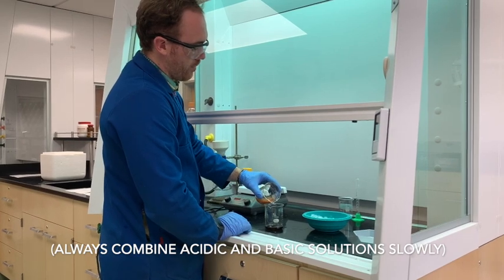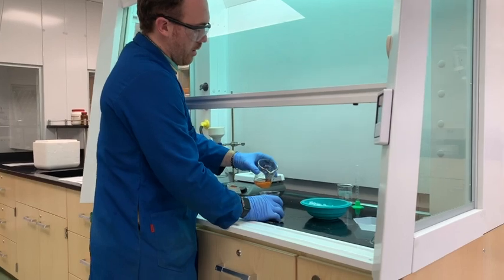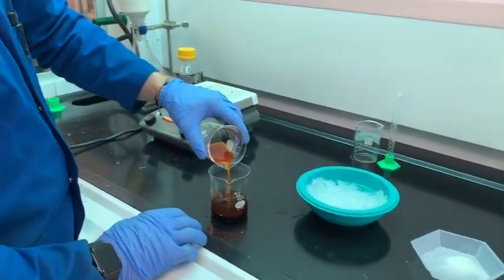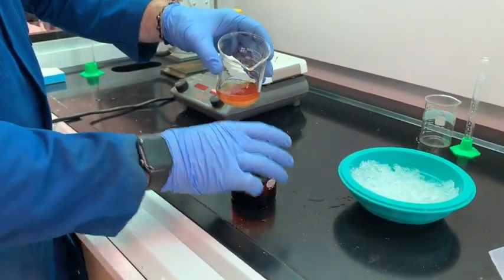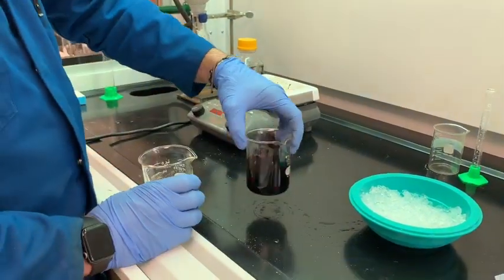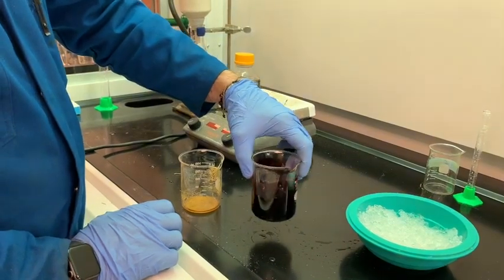So here we go. So I'm going to start stirring this. Turns into a dark, kind of almost scary bromine-like red. So we will let that mix.